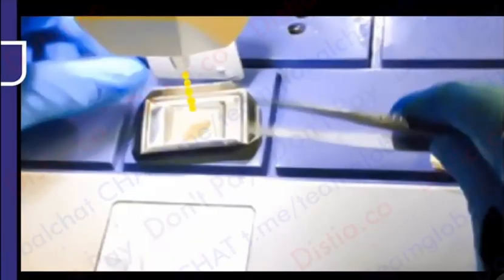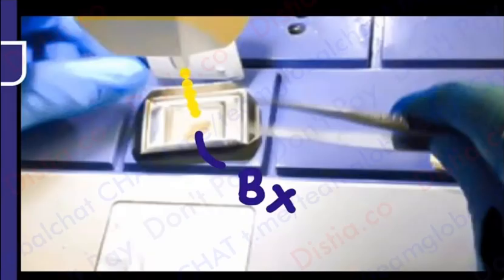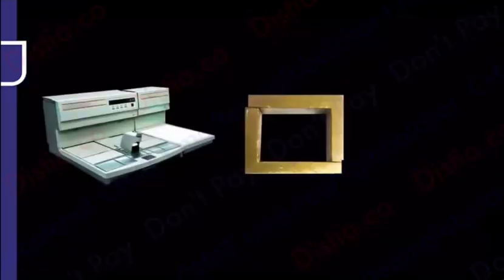Can we all notice this was the biopsy? This was the skin tissue, the skin biopsy. Can you see that this machine is adding molten wax into it? So am I in a way doing something known as impregnation, adding molten wax into it? And after that you will say, ma'am, we are going to do embedding and blocking. How are we going to do embedding and blocking?